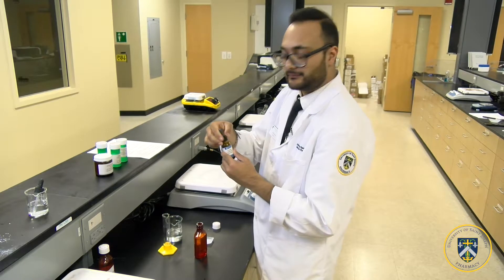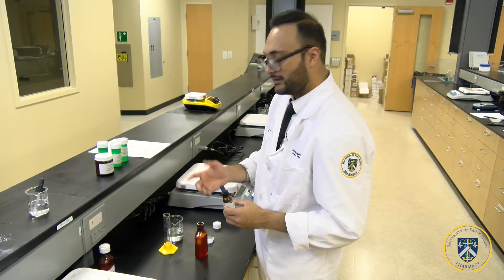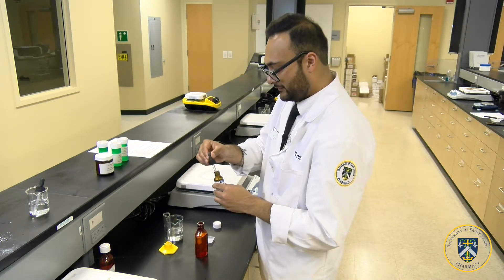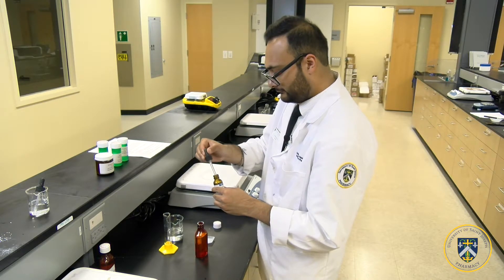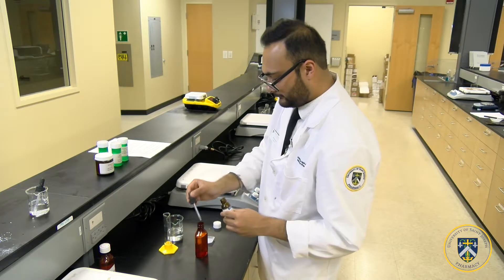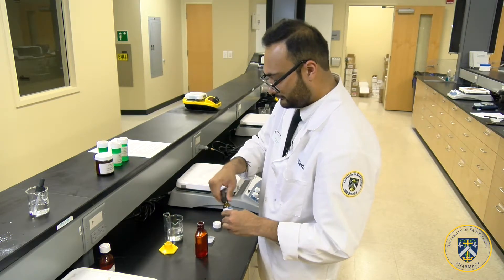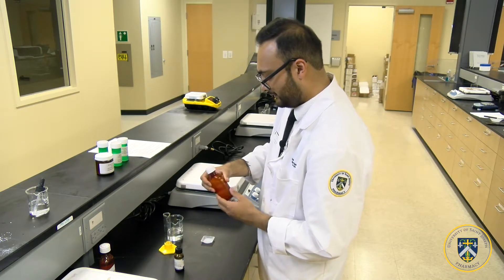To finish, add any flavor that you desire, because that is the essence of compounding — to create a product that caters to your patient. I'm going with a lemon flavor here. You don't have to add too much; two or three drops should be enough. Give it one final shake, and there you have it: vancomycin oral solution.